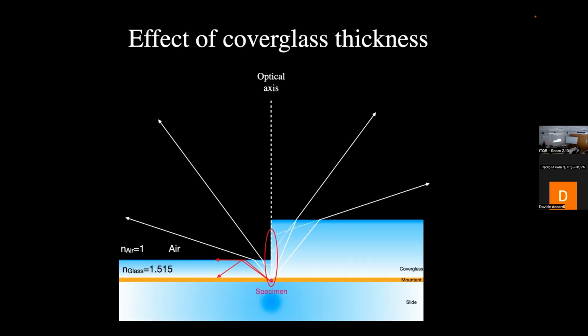So then, if you have like 10 microns of this glycerol between your specimen and the glass, light will first pass through glycerol, then bend inwards into the glass. You are using an oil lens, so the oil will not change anything. So it will go to the glass, to the objective, and then because of this bending inward of the light, you have structures that are artifactually squeezed, squashed. And Pedro might tell you a lot about these things. He is an expert on super resolution sample preparation.